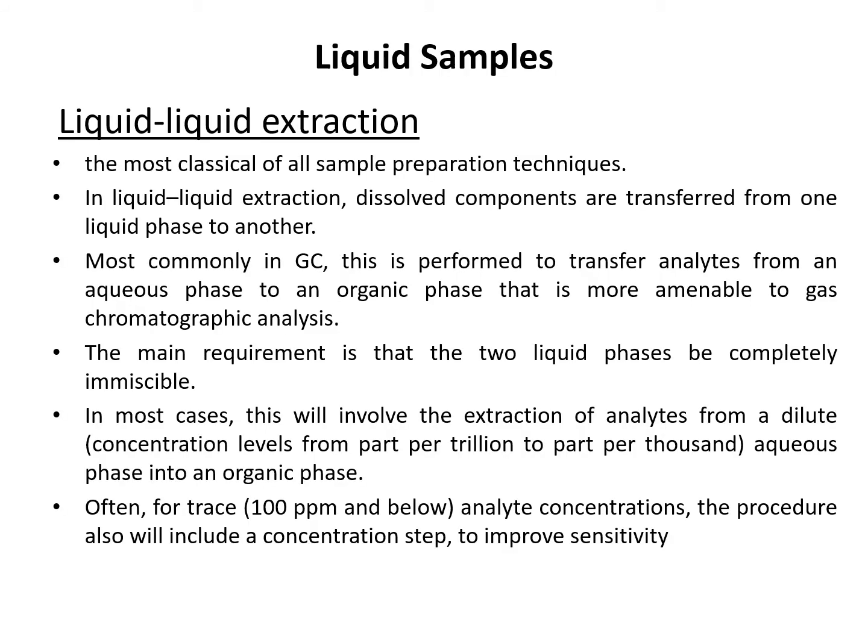Okay, students, let's move on to liquid extraction. Liquid extraction is the most classical sample preparation technique. In liquid extraction, dissolved components are transferred from one liquid phase to another. In most cases in GC, this is performed to transfer the analyte from an aqueous phase to an organic phase that is more amenable to gas chromatography analysis.